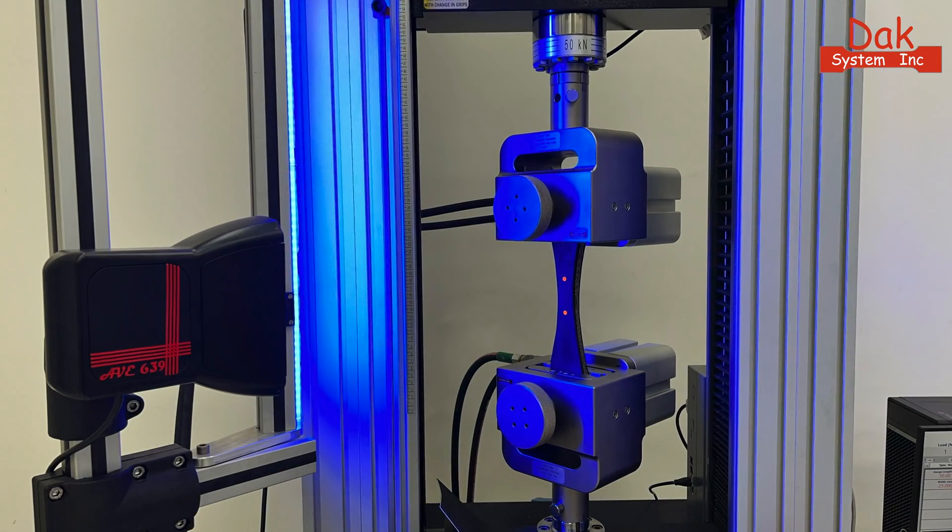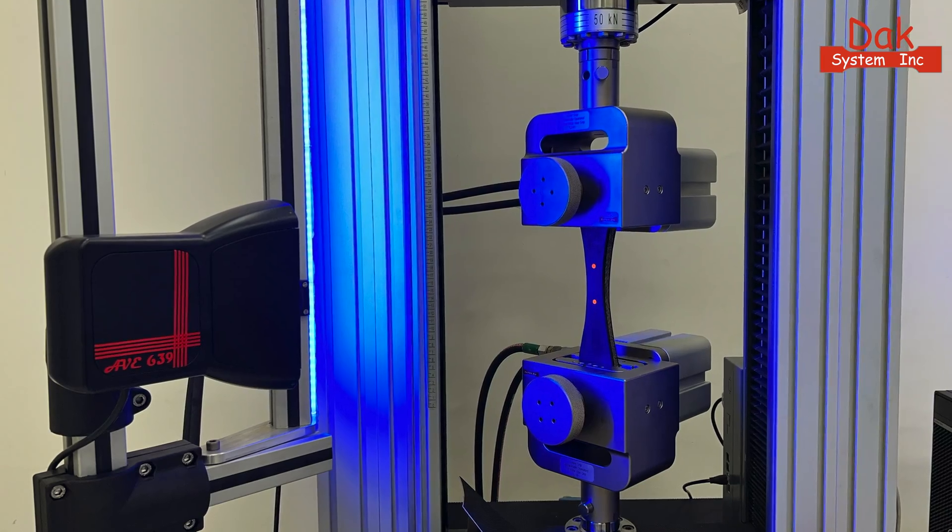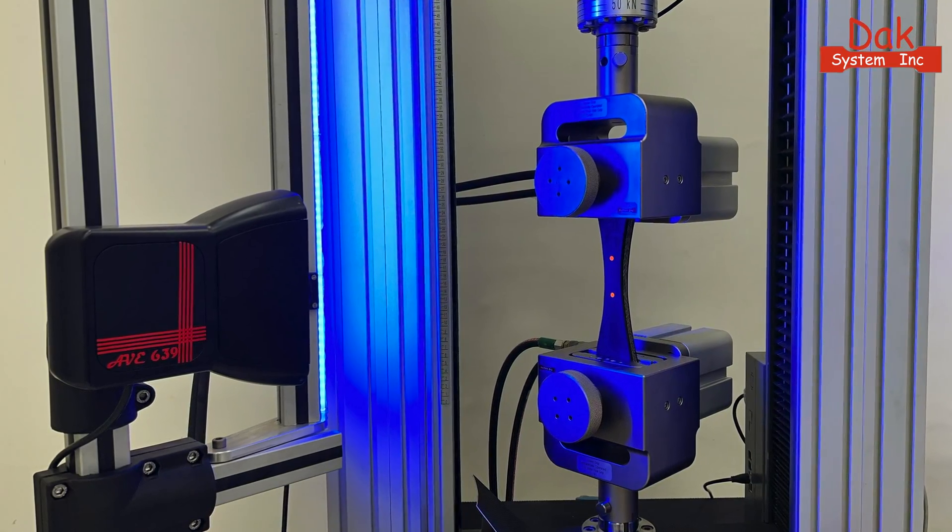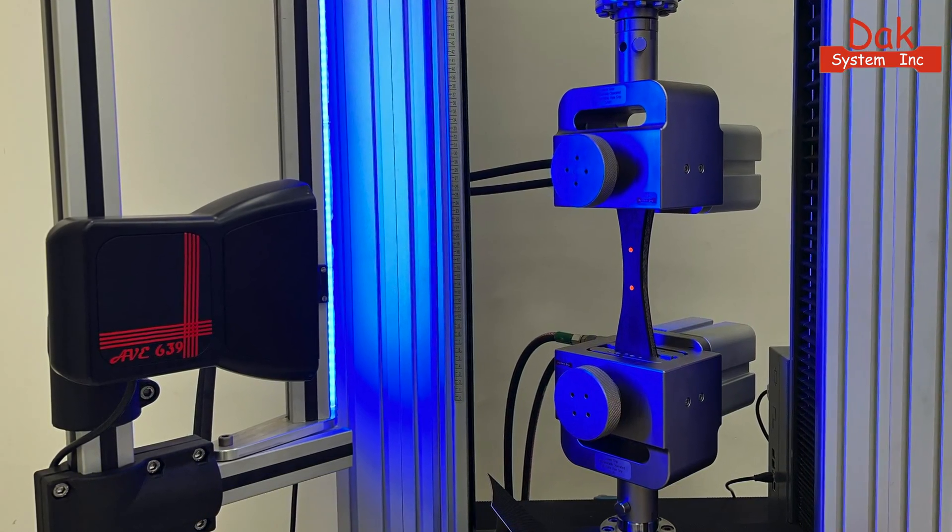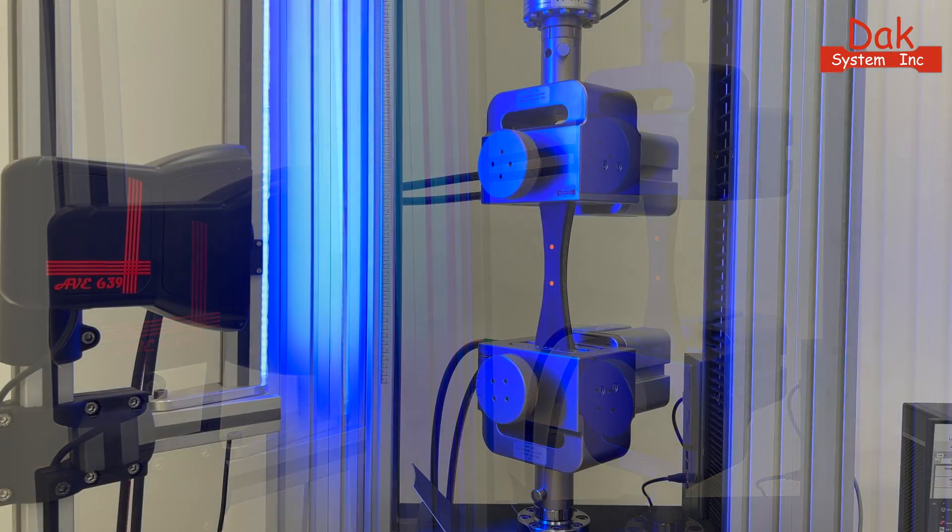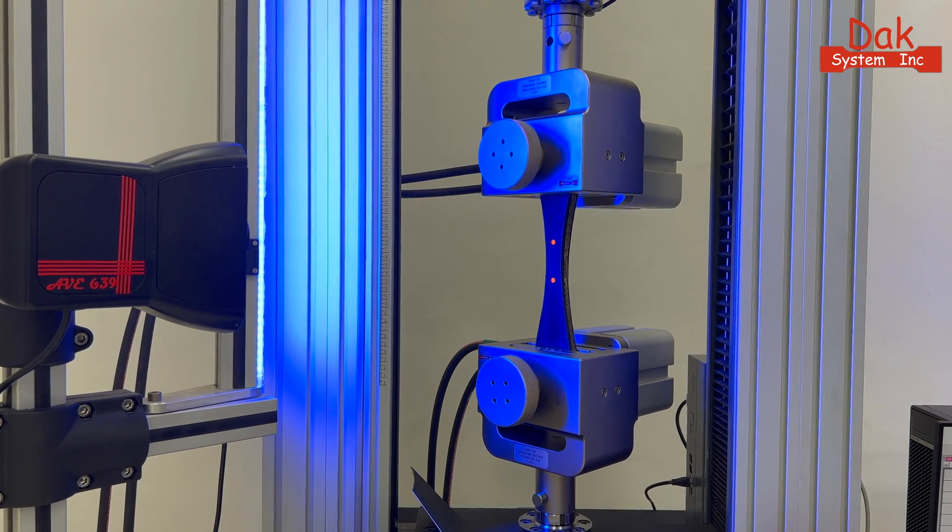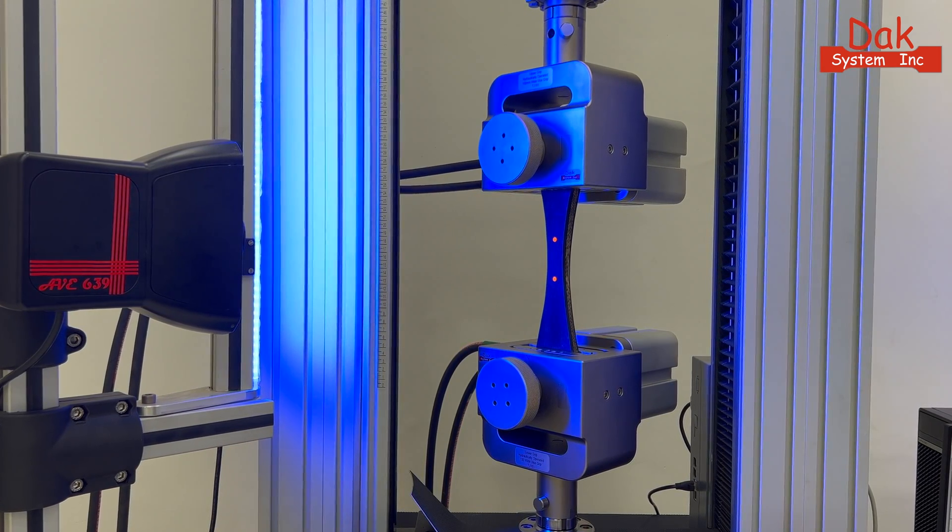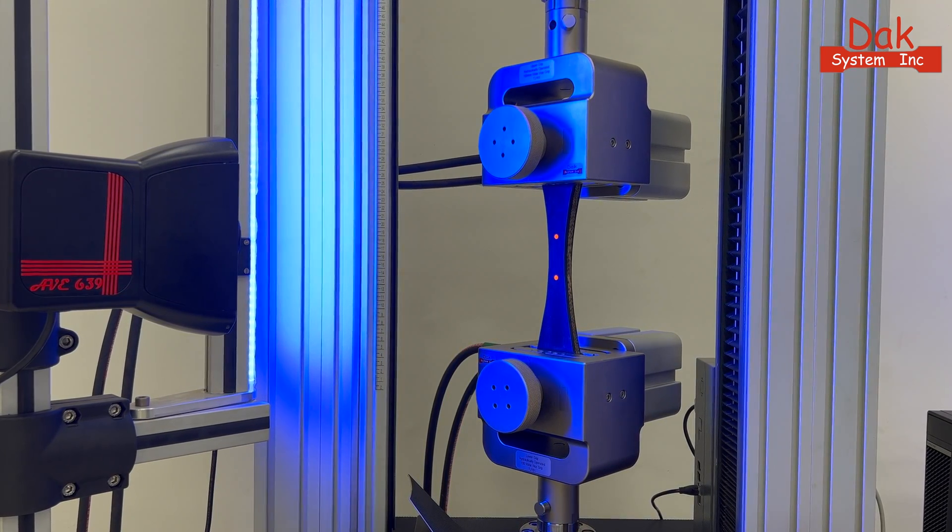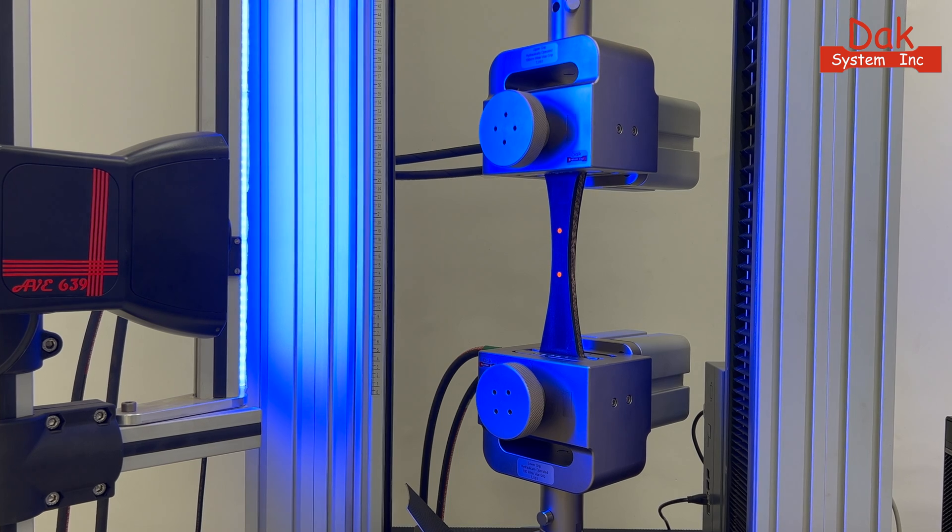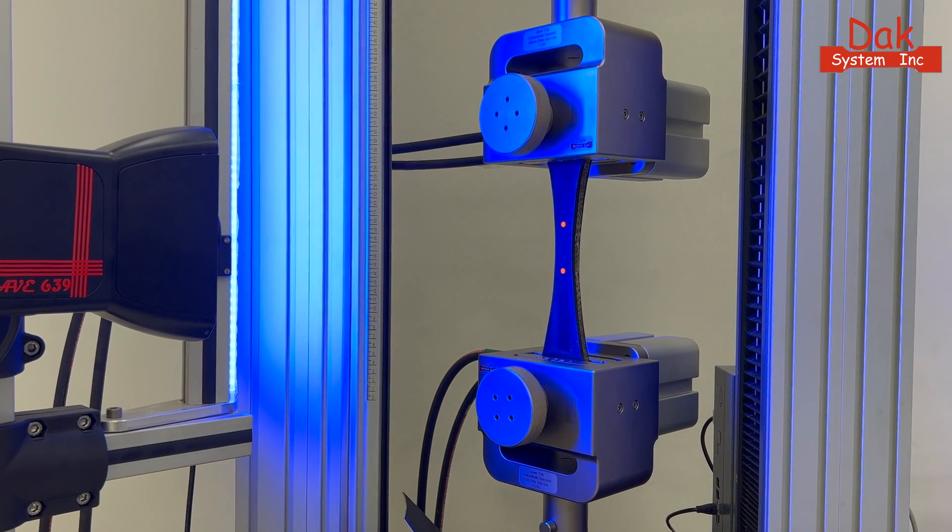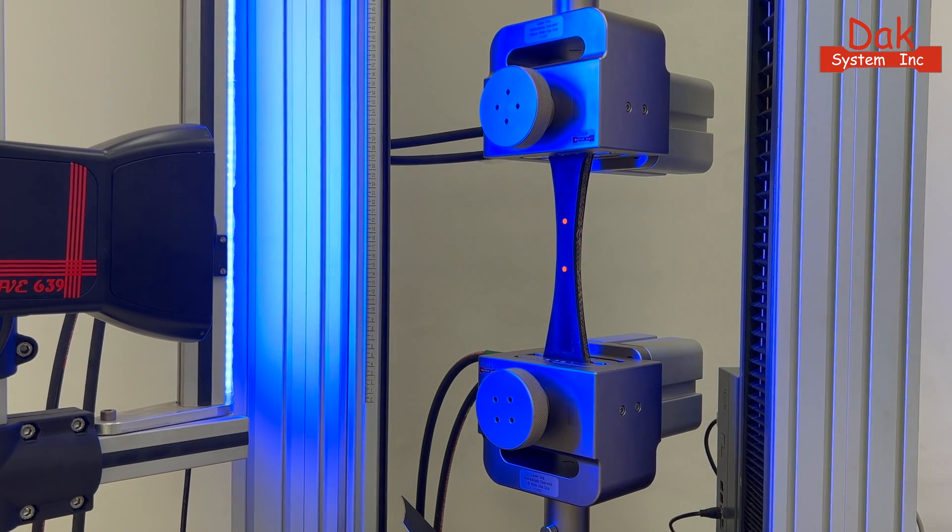Additionally, explore the option to utilize DAC's groundbreaking advanced video extensometer. With its intuitive gauge length markings driven by DAC's proprietary technology, this extensometer accurately captures and measures the specimen's elongation until failure.